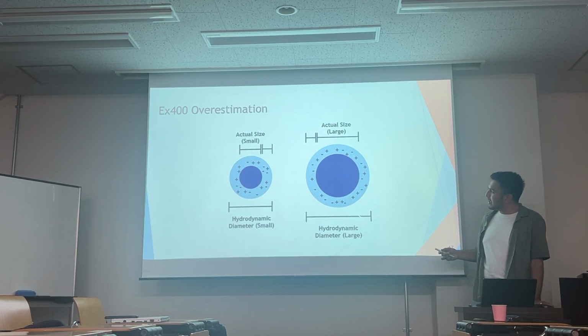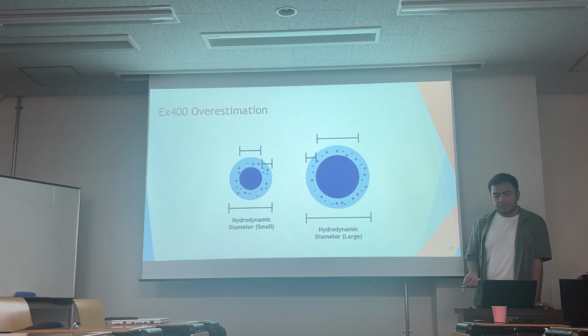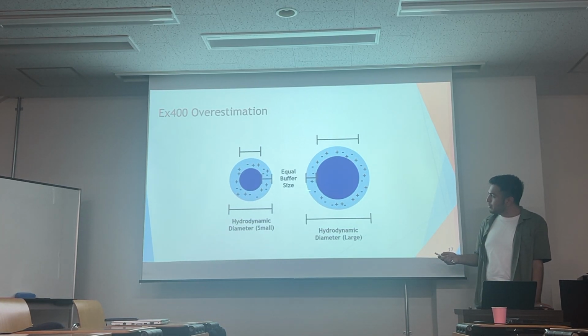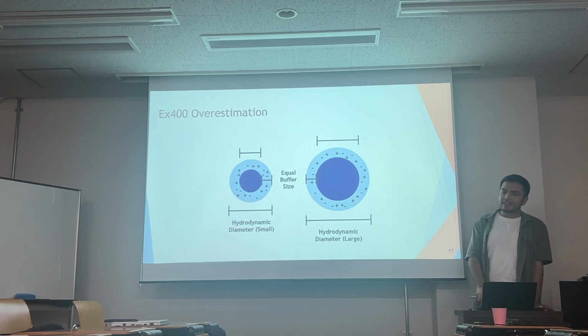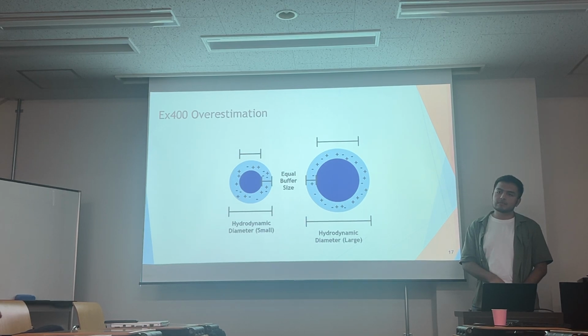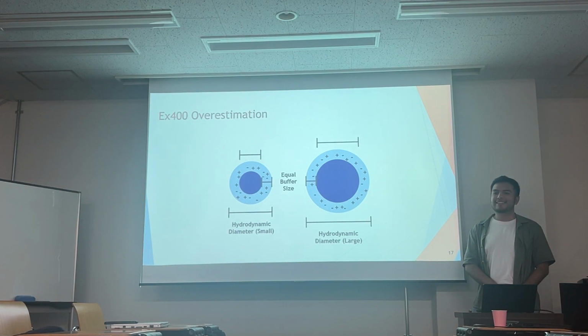So actually what I was trying to illustrate here was that they stay roughly the same, even if these are two differently sized particles. The difference between their actual size and their hydrodynamic diameter will remain roughly the same. Does that make sense? So you mean when the particle size is different, but the buffer size will be equal. Yes.